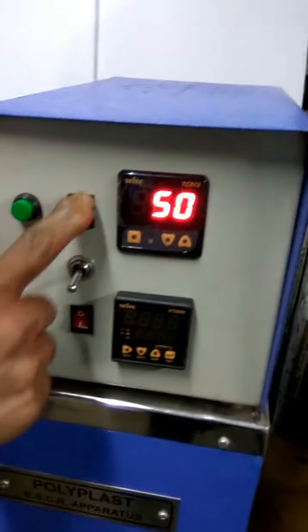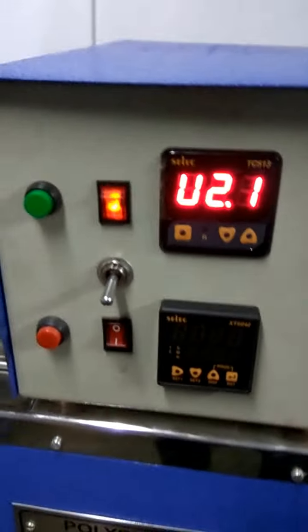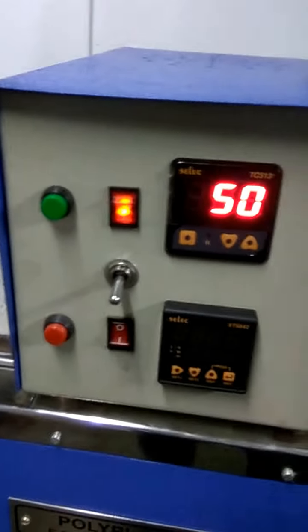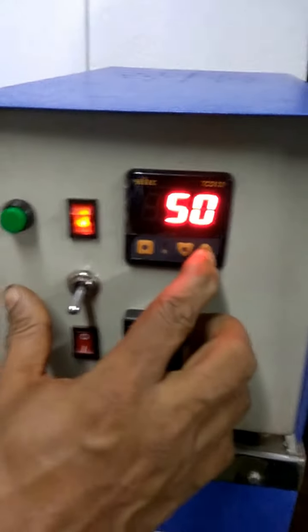Now the temperature controller part. You can control it — switch it on or off — and you can directly see the values. The temperature shown is 50. If you want to increase or decrease it, there is a program mode with up and down controls.